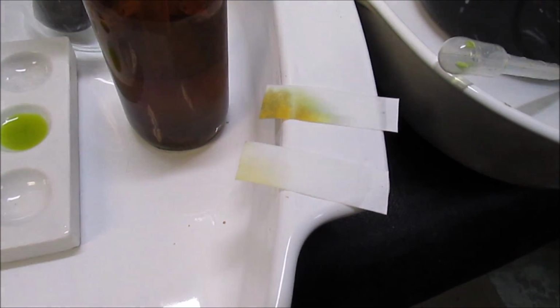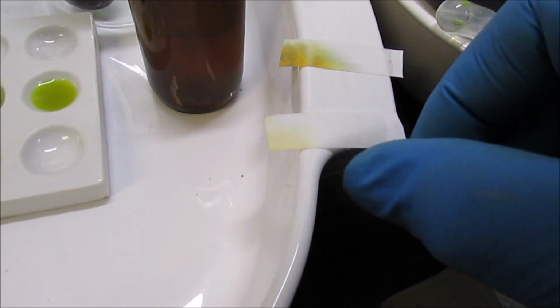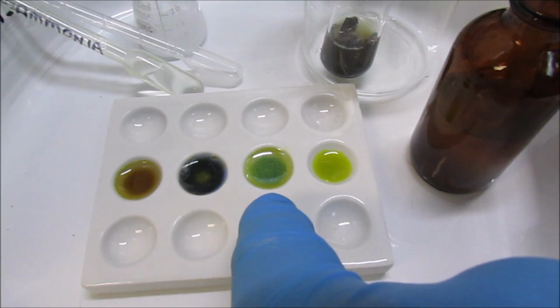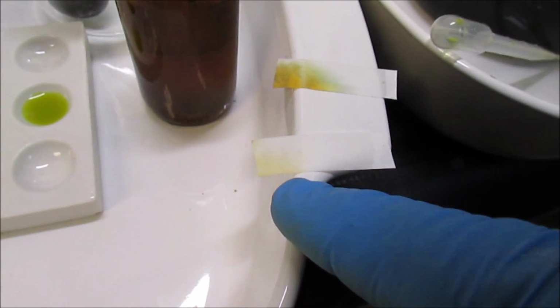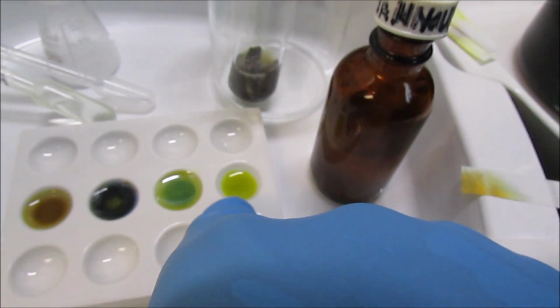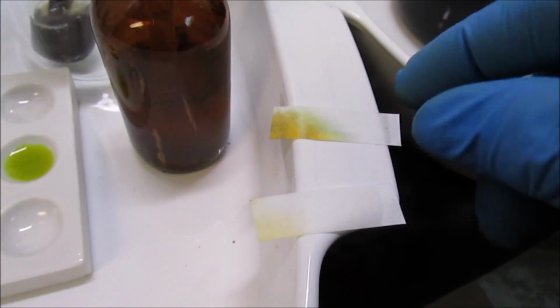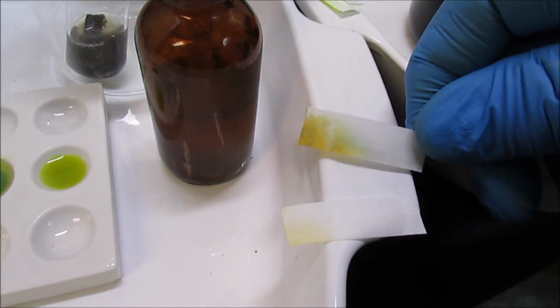Here's another look at the stannous tests. This one was from the solution out of cavity number 3 here from the DMG test. It's got just a faint trace of orange there. This one was from the cavity that had just the solution out of the beaker here. And it's got a nice green and orange stain.